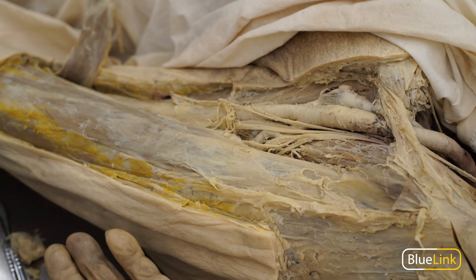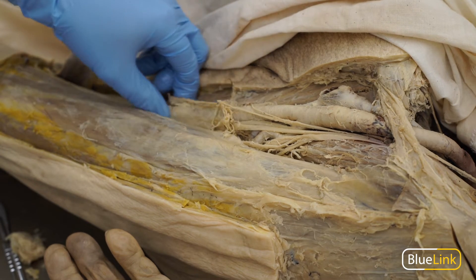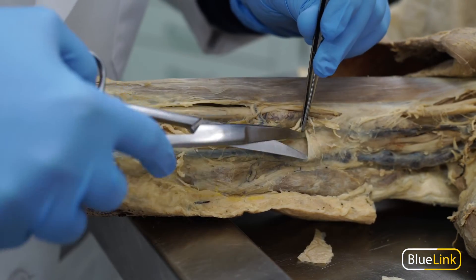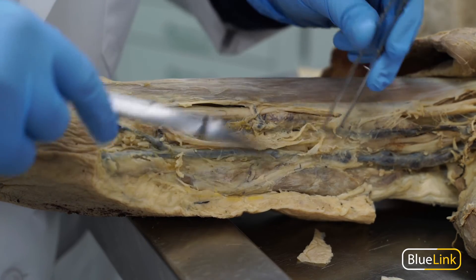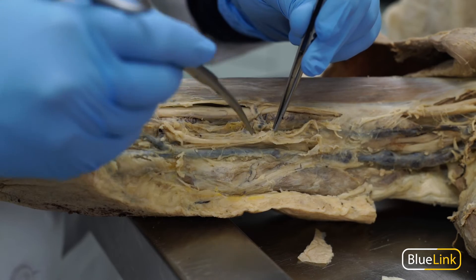Now that the sartorius muscle has been reflected, we can see a bundle of neurovasculature that lies deep to it — that's going to be the femoral artery, vein, and nerve. Here we're looking at the arm, where the neurovasculature is typically significantly smaller than the neurovasculature found in the lower limb.